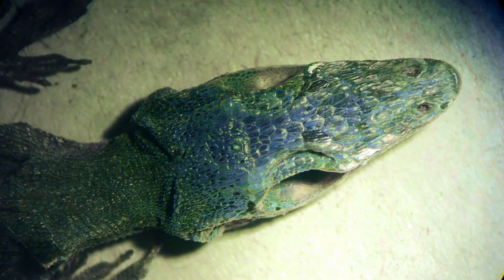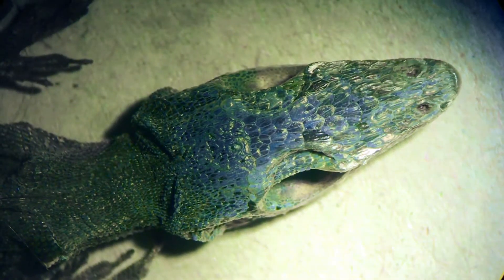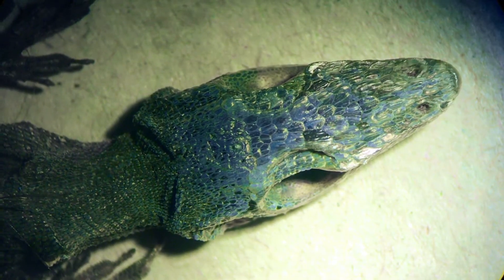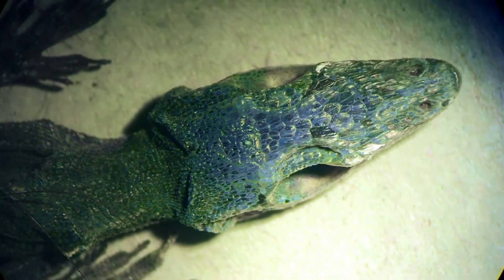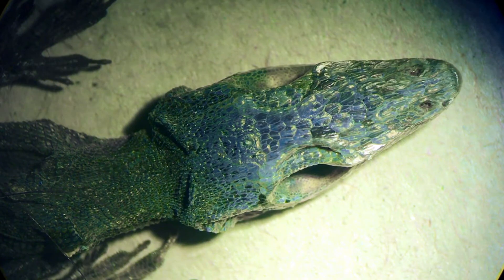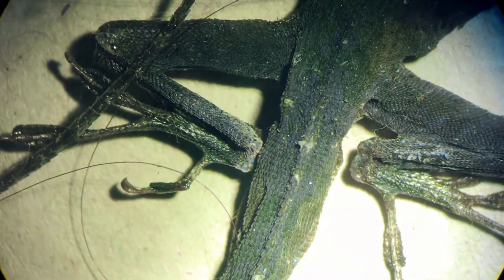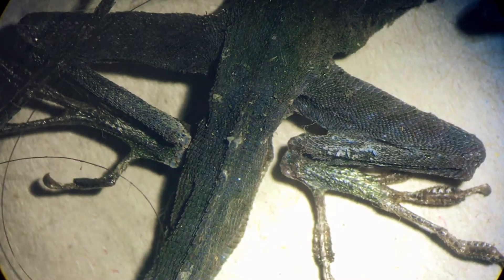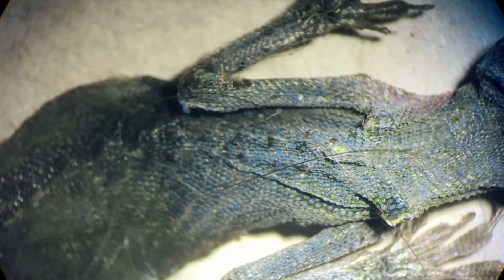I found a dead lizard and I thought I would look at him under the microscope. He seems to have been dead for quite a while — he's very dead looking. That looks pretty cool. I like to see things up close and whatnot. Let's see if we can see his scales or something.